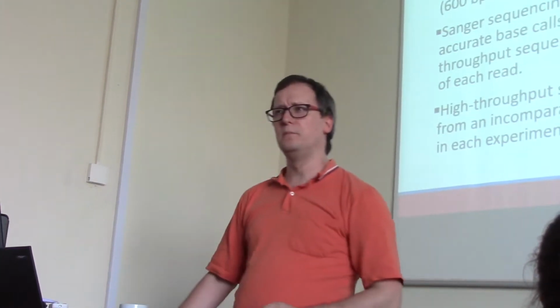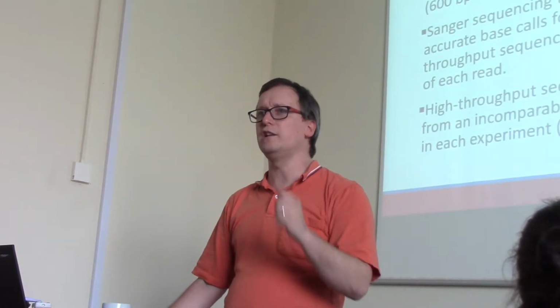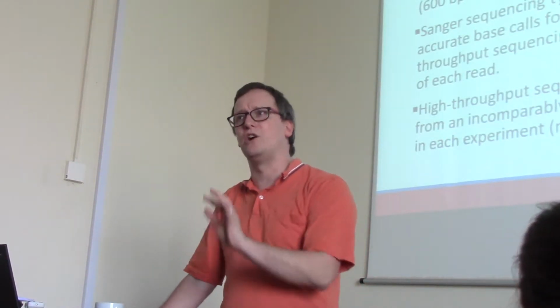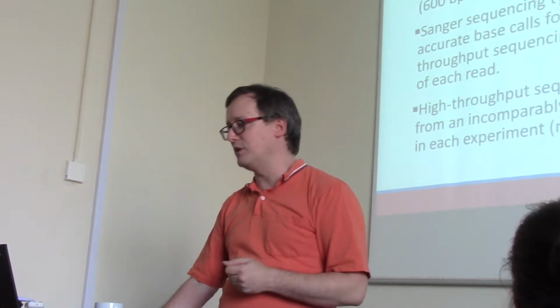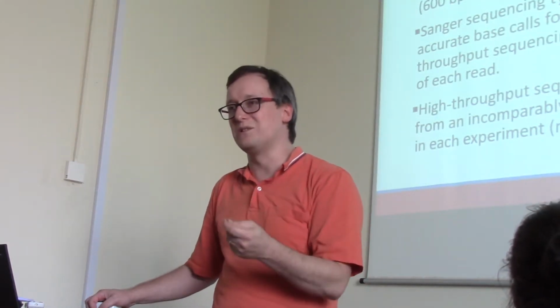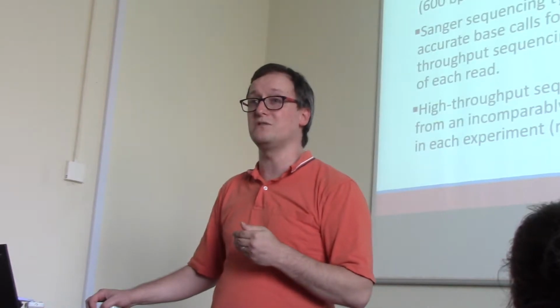A lot of people assume that any new technology is clearly better than any old technology. And I want to rescue people from that notion. Newer is not always better in all respects. And one of the problems that we encounter is that today's sequencers tend to produce a lot shorter sequences than what we are used to.